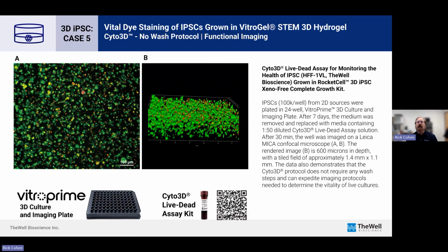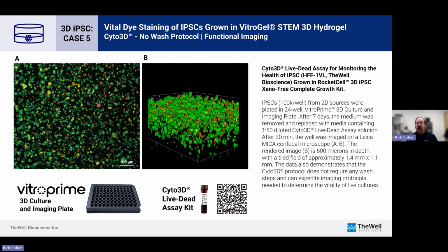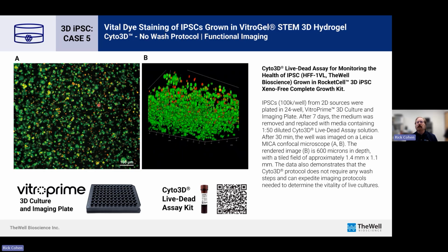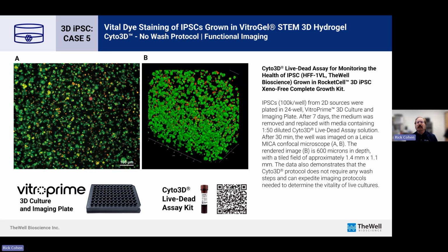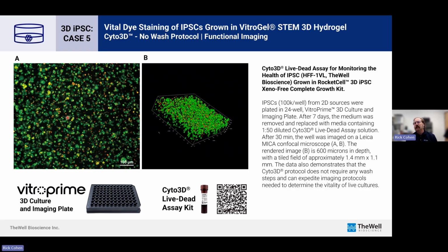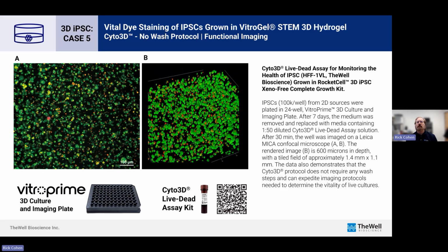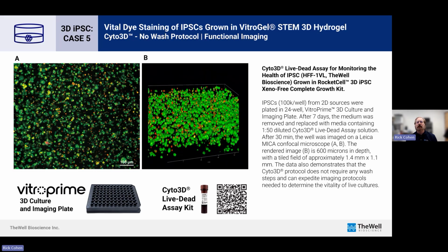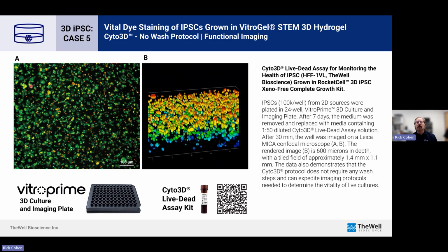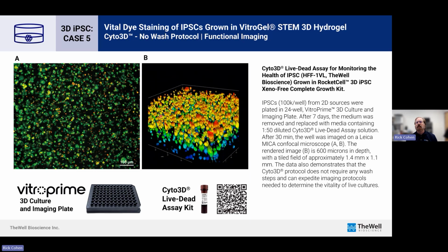And the staining with the red color is very bright as compared to the red fluorescent protein. So even though we're using a line that has red fluorescent protein, the vital dyes are much brighter, 10 times brighter. So you're able to differentiate based on brightness when you use a confocal microscope, and you can see green and some red, some yellow overlap, which you could discern using this 3D imaging.